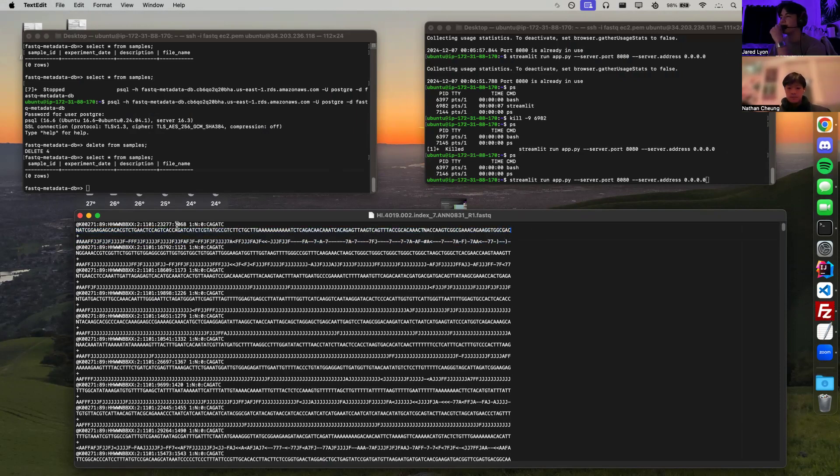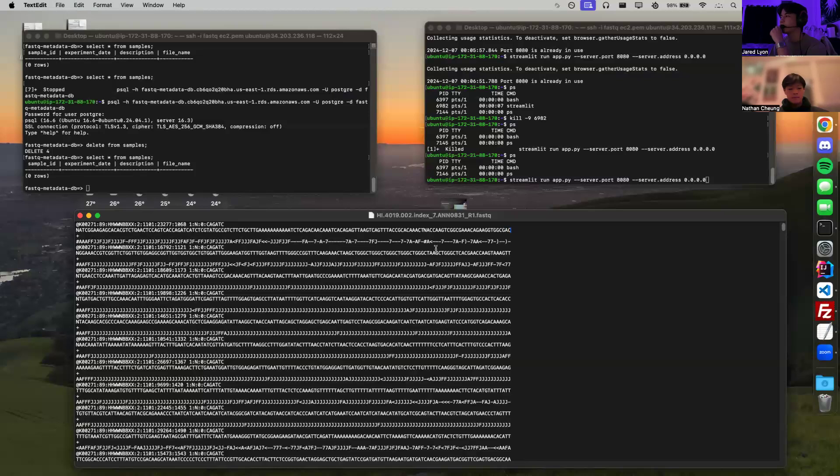So we're counting the number of lines in the file, and then we're giving you the average quality score of all the reads that were in the file.